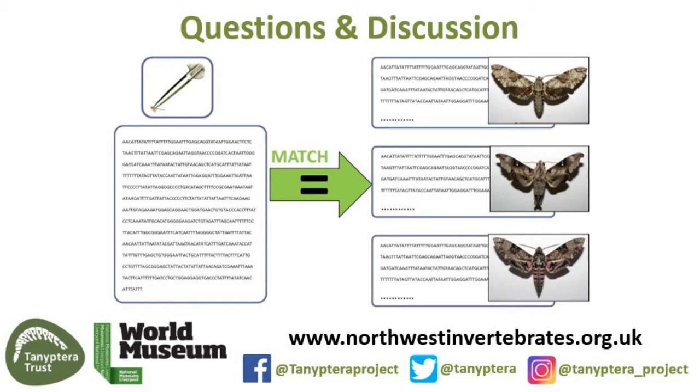Does the material have to be fresh, or will barcoding work on insect specimens which have been dried for days, months, or years? Yeah, good question. Obviously fresh material is better, but it can work with material that's been dried for 100 years. You can get DNA barcodes from that kind of material as well. It depends on how they've been preserved, but it's possible.